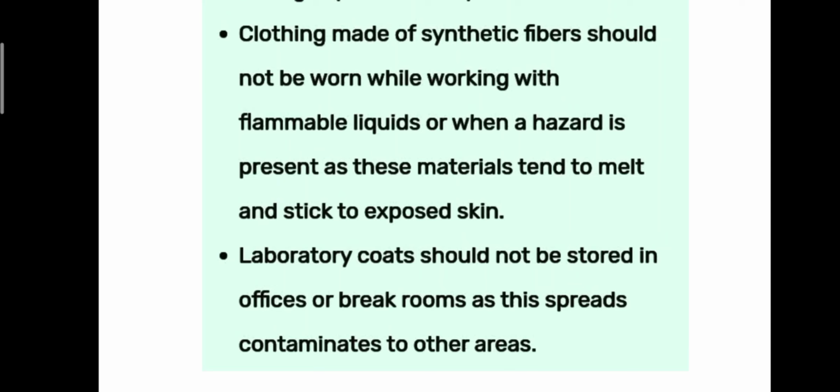Clothing made of synthetic fibers should not be worn while working with flammable liquids or when a hazard is present, as these materials tend to melt and stick to exposed skin. Laboratory coats should not be stored in offices or break rooms, as this spreads contaminants to other areas.